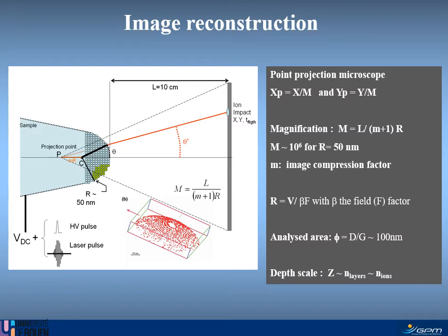So if you had a strict stereographic projection, M would be equal to 1. But instead of that, generally M is not exactly equal to 1. It can be equal to 0.7, 0.8, 0.6.